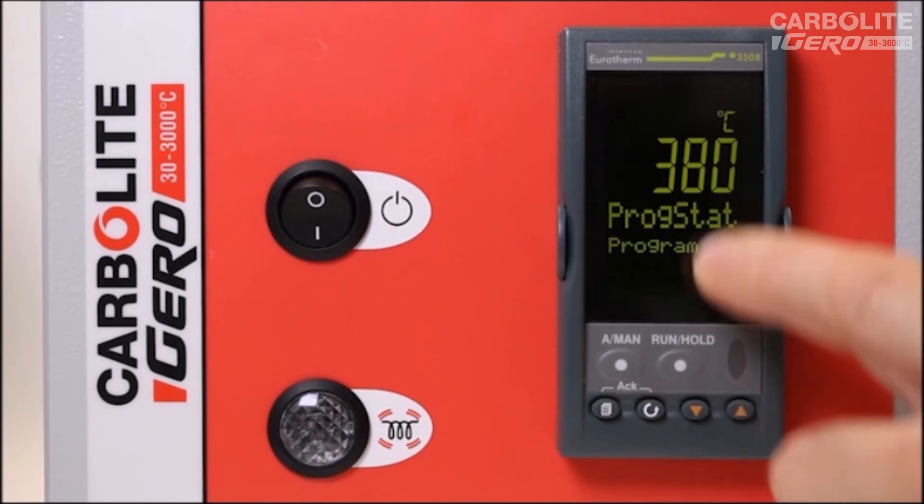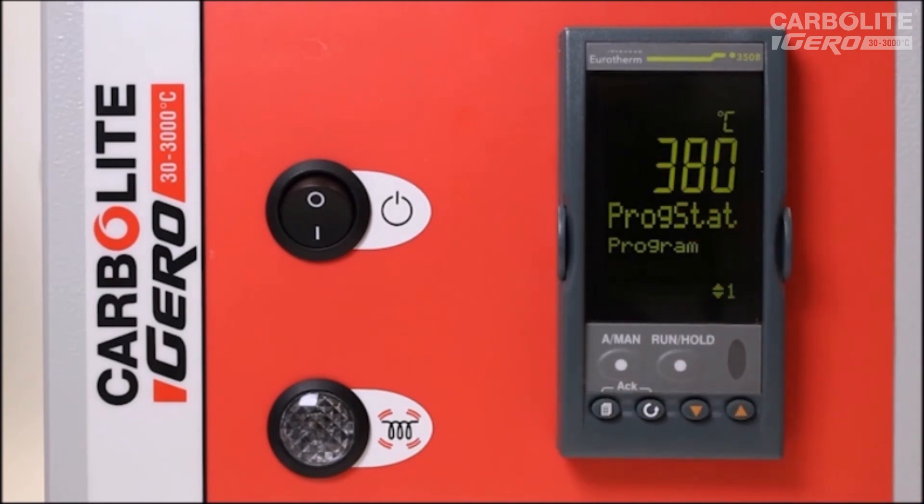To cancel the program, we press and hold the run/hold button for one and a half seconds. The run indication switches off and the program is no longer running.